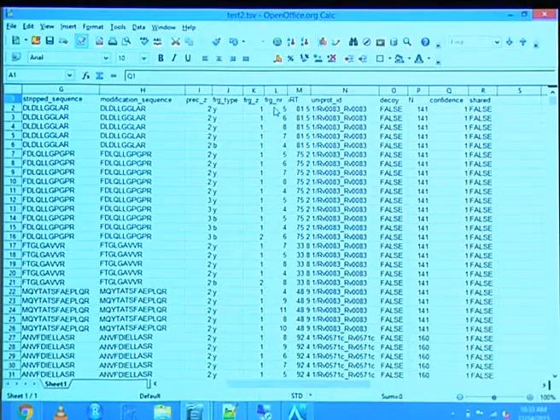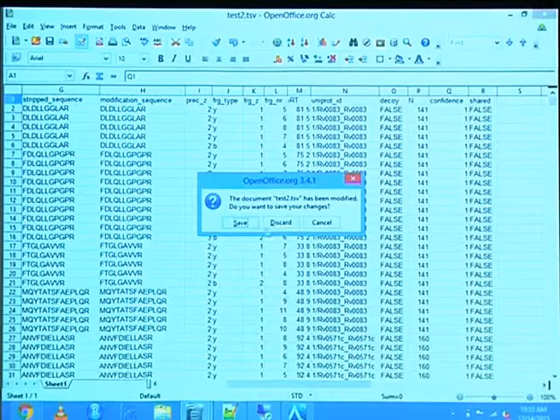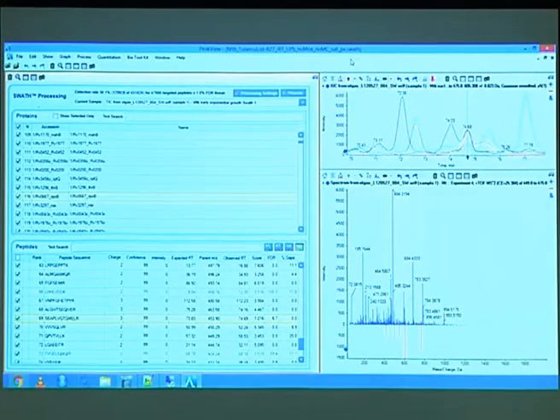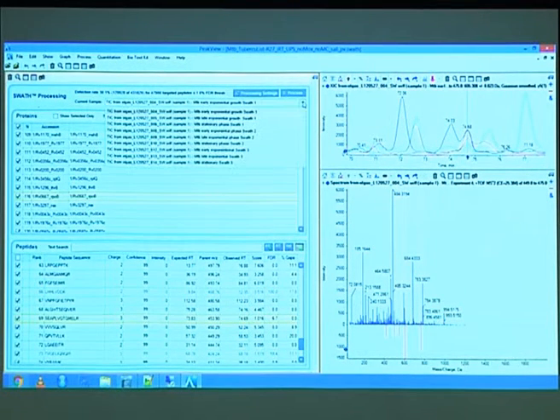I mean, these are just like 300 assays. This is not that many. I'll do it this way again because like this I can have a cheat sheet that I know what I should show you. Okay, so now I loaded this file where you see now there are 9 files.